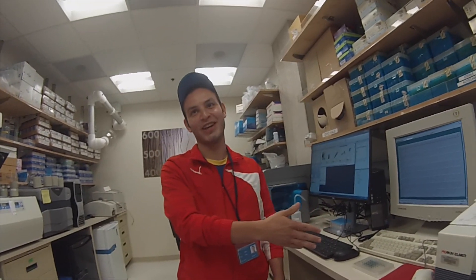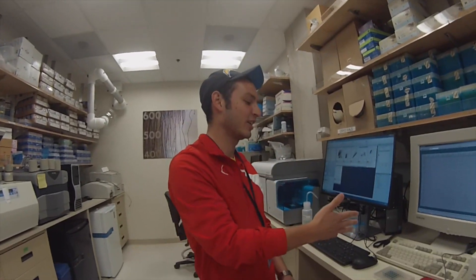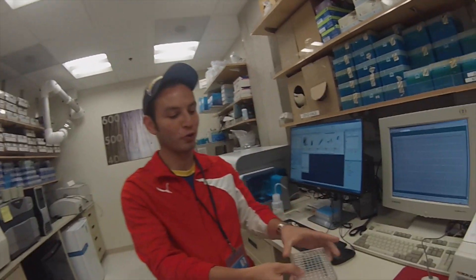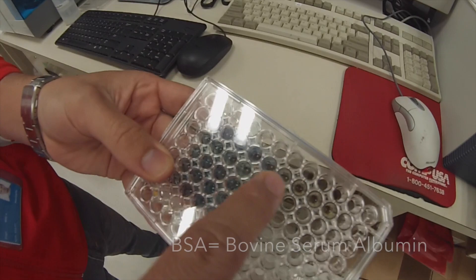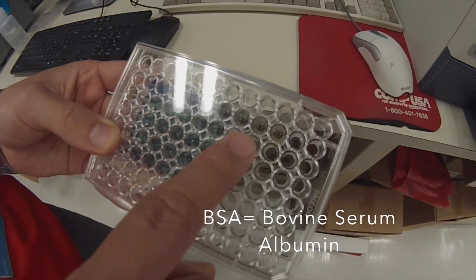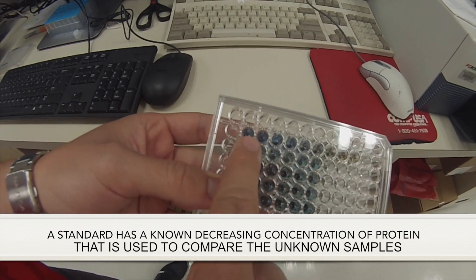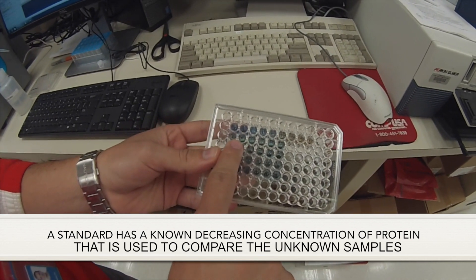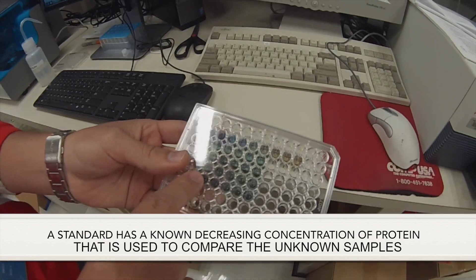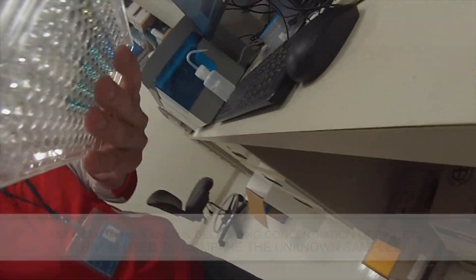Right now we're at the plate reader and we're going to compare a standard dilution of BSA in this row. We want to compare that because this is an already known quantity of protein and we want to see how much protein we have in our samples. That's why we're using the plate reader.